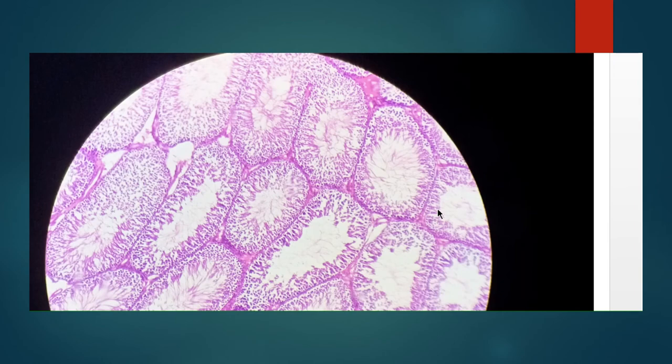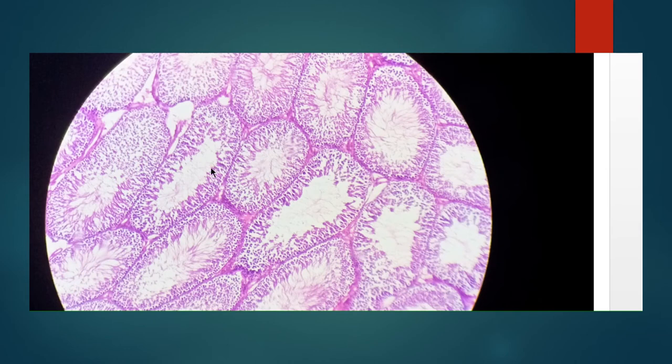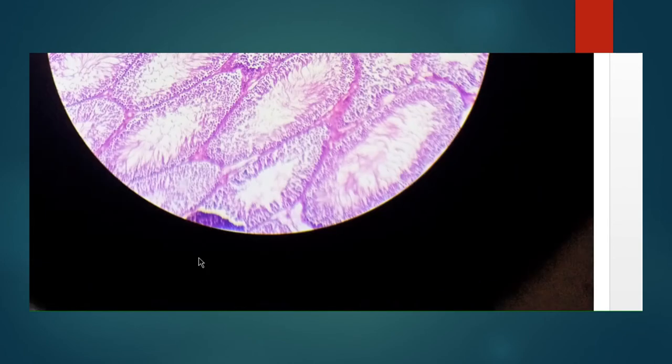Now, coming to the next system, the reproductive system. How to identify it? We can identify these rounded structures. These are nothing but your seminiferous tubules. If you take one tubule, towards the lumen you can identify tail-like projections. Those are nothing but the tails of spermatozoa. Spermatogenic cells and spermatids are present at the periphery, and the mature spermatozoa are present towards the lumen. That is nothing but your testis identification.